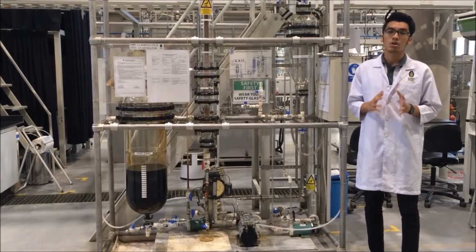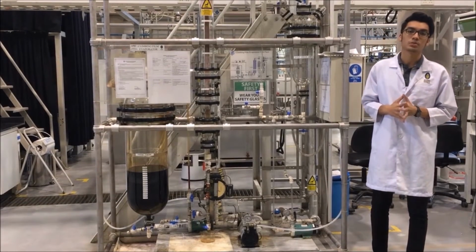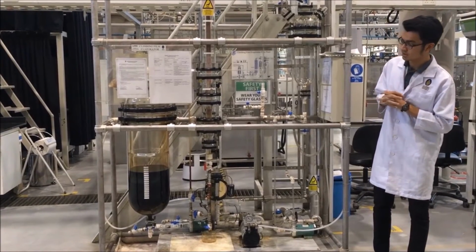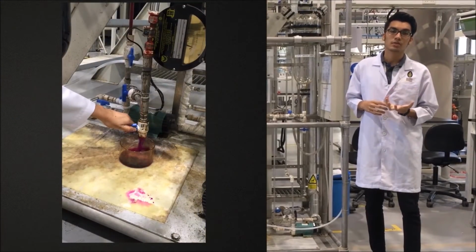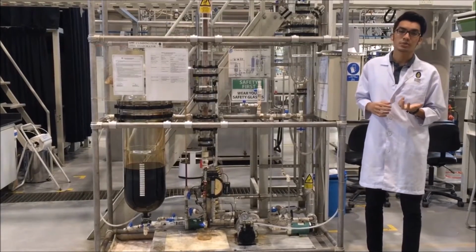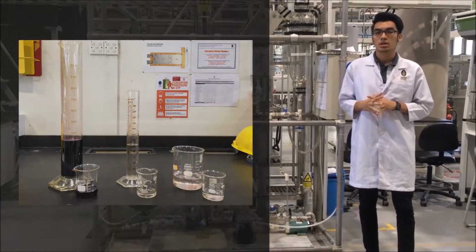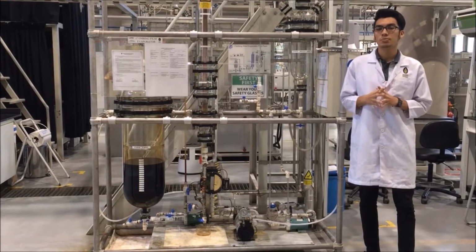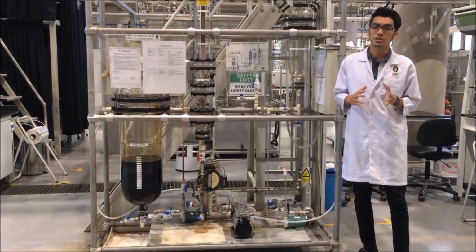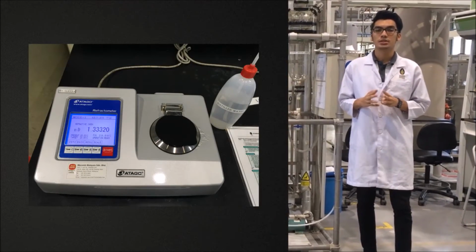After all the concentrate has been pushed into the tank, close V9 and turn off the pump as well. Then you can take samples out. For the evaporator sample, put a beaker under the valve and the collector and take the samples. After all the samples have been taken out, use a measuring cylinder to measure the volume of each sample. After the volume has been measured, gently put all the samples into a small beaker and pour the remaining samples into the feed tank. The refractive index of these 3 samples is measured and recorded as well.